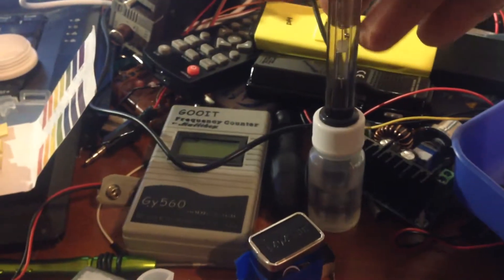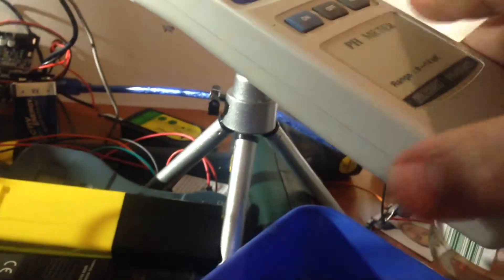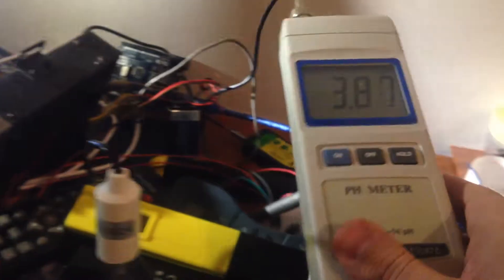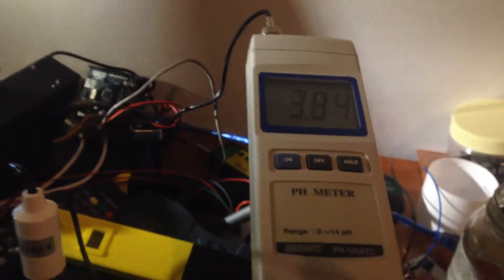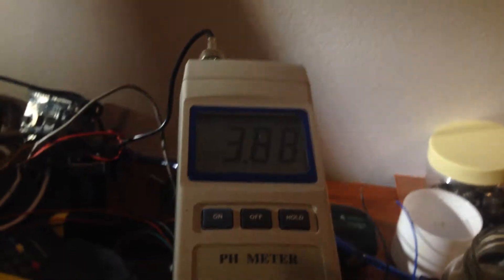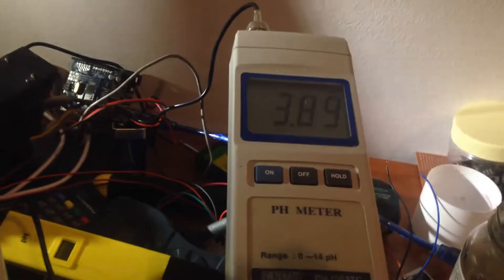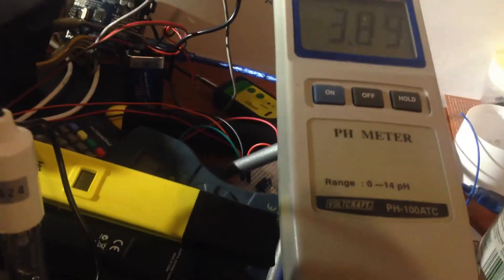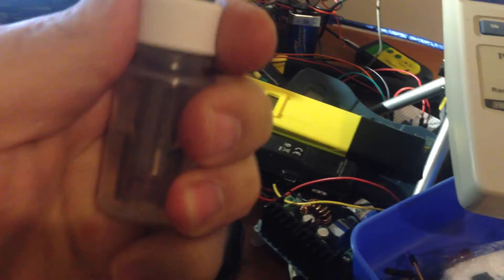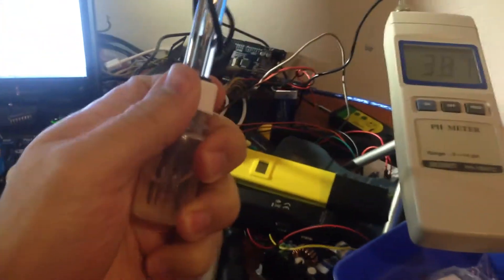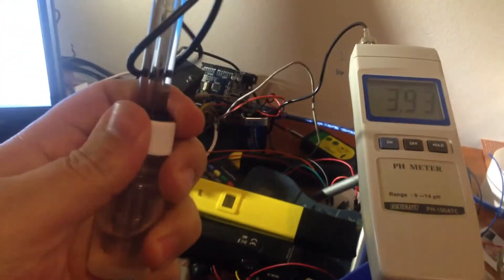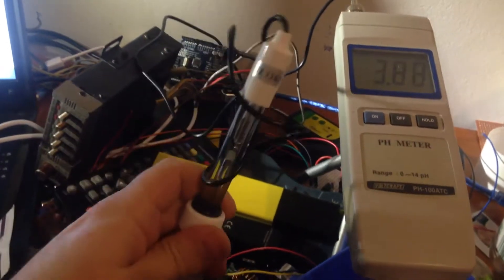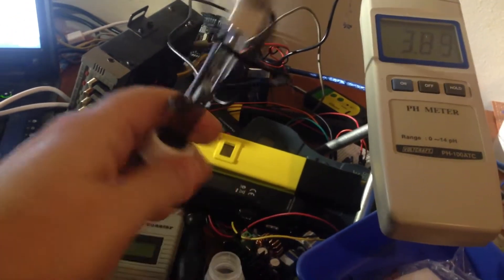This device will go to the nice LED lights like this to adjust exactly the rotation of the meter. To test, I will try to open the calibrating liquid. The calibrating liquid is 3.88 to 4.